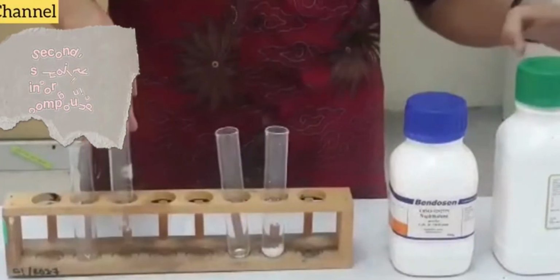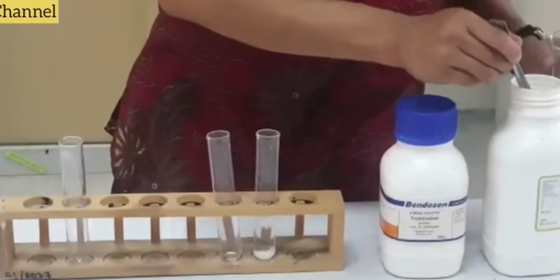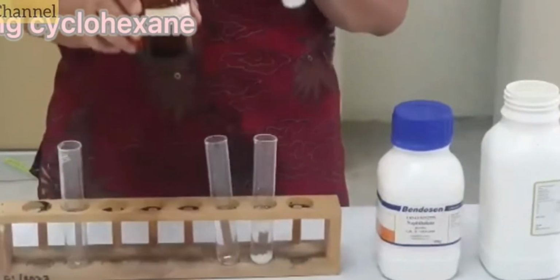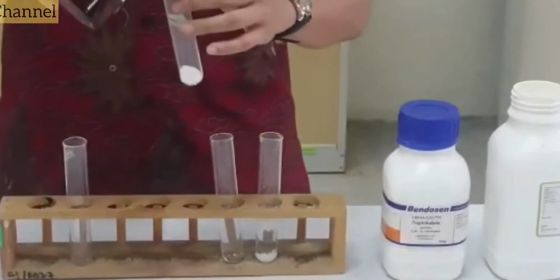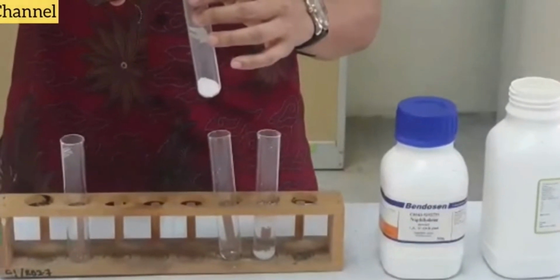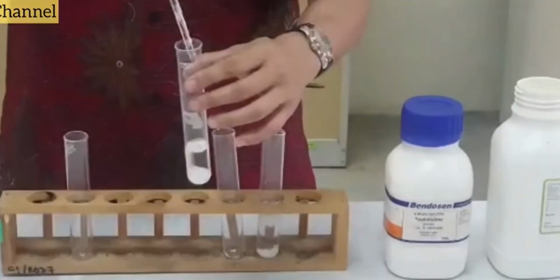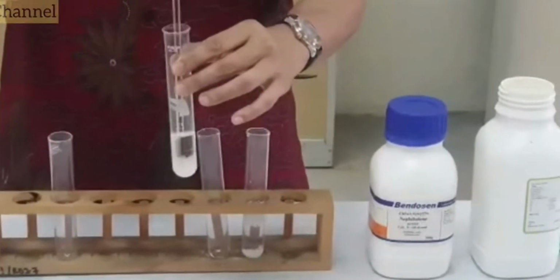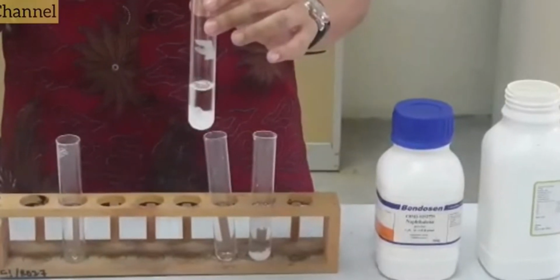First, take your magnesium chloride. 这次我们是用 organic solvent, cyclohexane. Take some cyclohexane as your organic solvent and pour into your test tube. Make sure to stir the two mixtures together. And now, as you can see, the magnesium chloride does not dissolve in the cyclohexane.